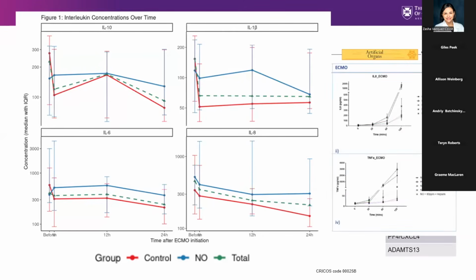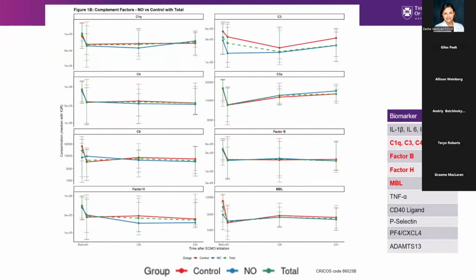We compare that to the Melfordheimer paper that was mentioned earlier, where they see this beautiful elevation of IL-8 and TNF-alpha. We just didn't see that in real life. We measured complement. And I don't mean to be facetious, but it gets really boring: a bit of a drop, and then it's just flat.